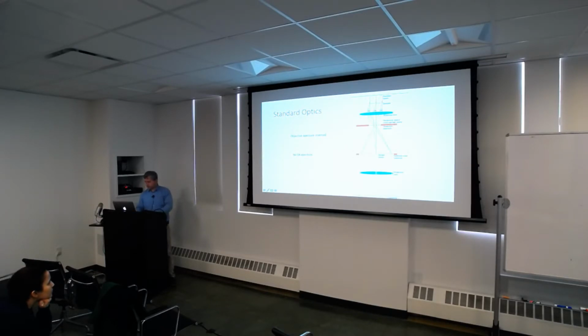This is a sort of image you should be familiar with by now. It's standard electron optics, where you have the electron beam coming down and your sample inserted in the microscope. The electron beam is scattered by the sample, and then focused by an objective lens. In the objective plane, or back focal plane, you end up getting a diffraction pattern of the image, or a Fourier transform of the image.